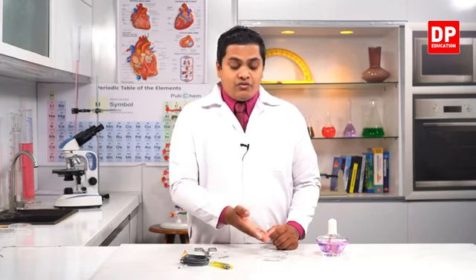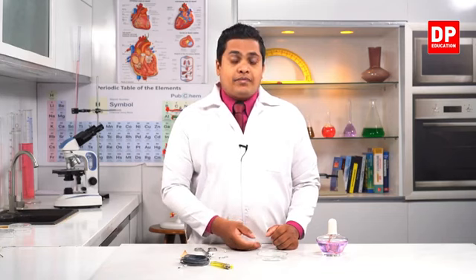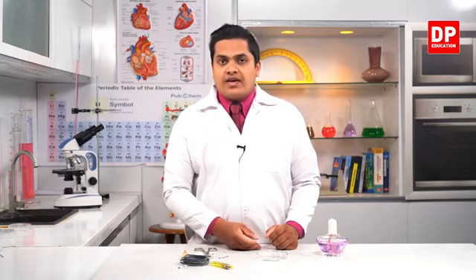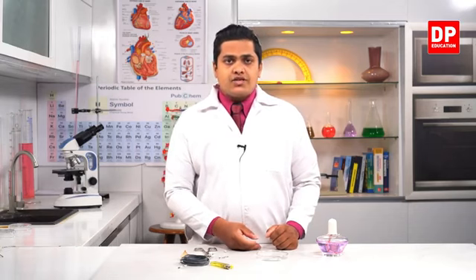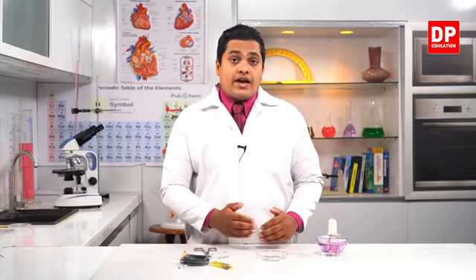You can't change this powder back into a piece of magnesium strip, because these chemical reactions or chemical changes cannot be reverted back to the original stage. So we'll carry out some other experiments in order to get some idea about these physical and chemical changes.